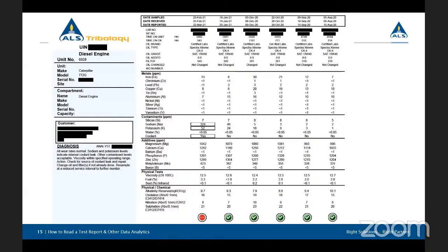What's going on here? Well, this is one of the fun things about looking at oil analysis reports, because it takes you down a path of trying to understand all the things that are contributing. For a diesel engine, it comes back to its operating temperature. An engine runs really hot, and that oil gets hot. Now, the oil doesn't necessarily have to get up to the boiling temperature of water to have that moisture released.